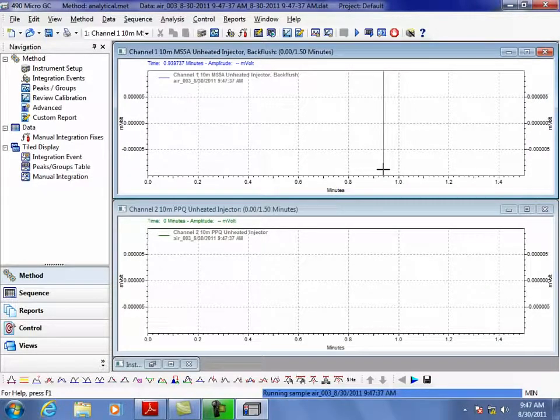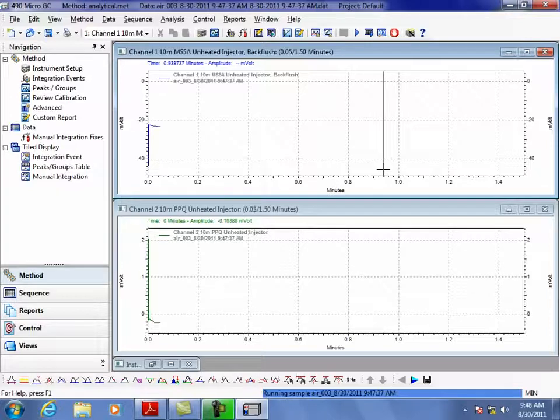The software was developed originally to run micro GCs. Scientific Software Incorporated was the name, SSI. Then the guy who wrote it, who happened to work for MTI, which was the first micro GC out there, split off, and he said, I'd like to take my software with me when I go. And so he kept his software and started developing it, and it became a client-server type full-blown chromatography data system so that you could hook up 200 different analyzers and 15 different servers and pull it all in and access it from anywhere.